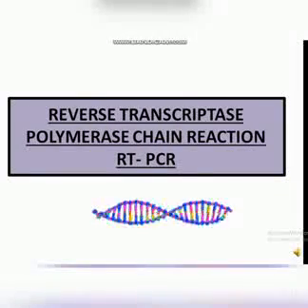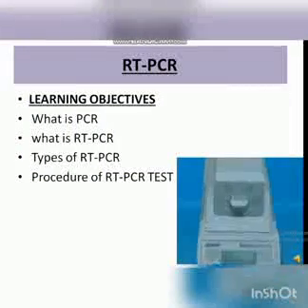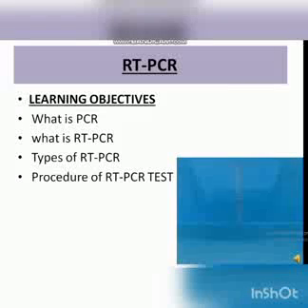Assalamu alaikum everyone. Today we will discuss reverse transcriptase polymerase chain reaction, RT-PCR. In this lecture we will discuss what PCR is, what RT-PCR is, types of RT-PCR and the procedure of the RT-PCR test.